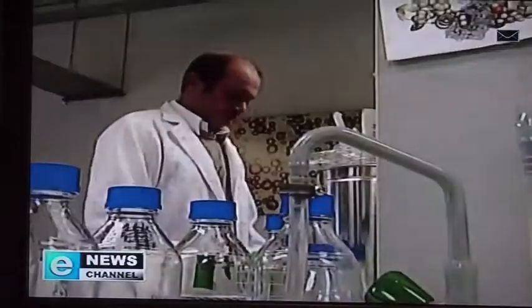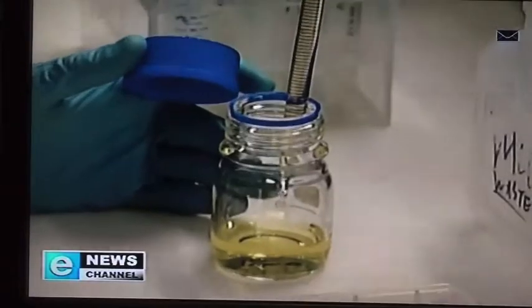Apply a man-made pressure to guide or direct the evolution of the enzyme that we're interested in for a very specific type of application. The methods used in this lab were developed by various scientists around the world, and the lab itself cost 10 million rand to set up. Primarily, it's used to find better ways to treat diseases.